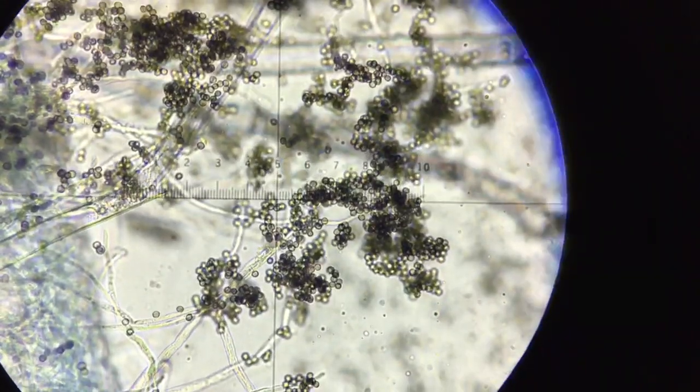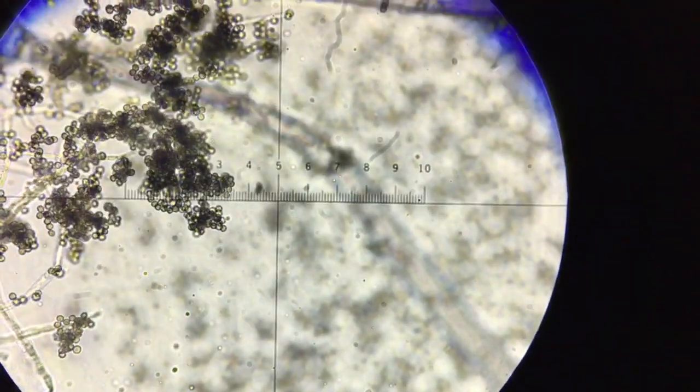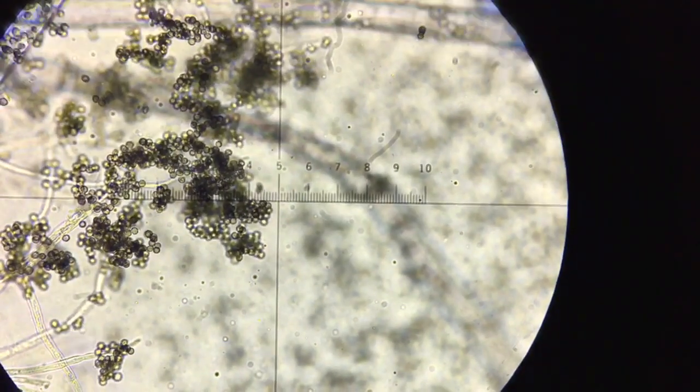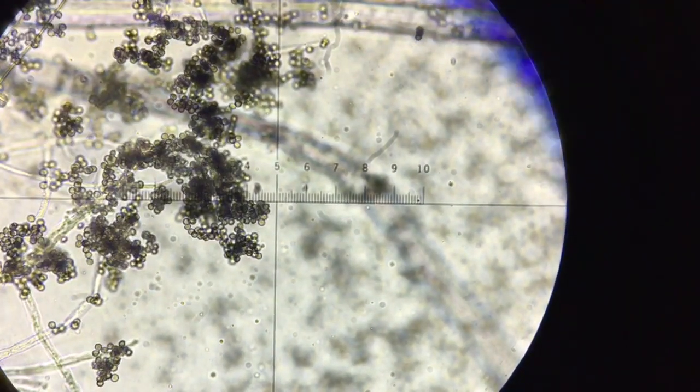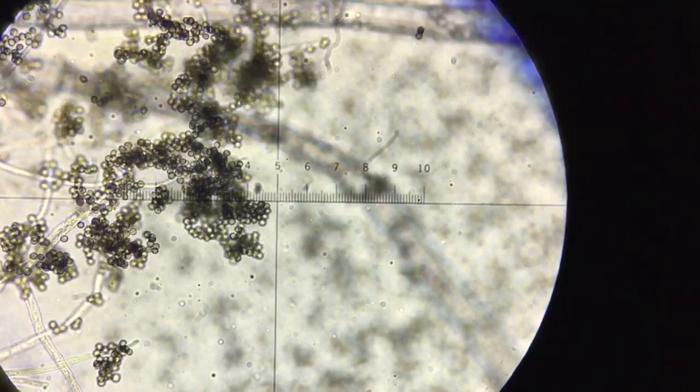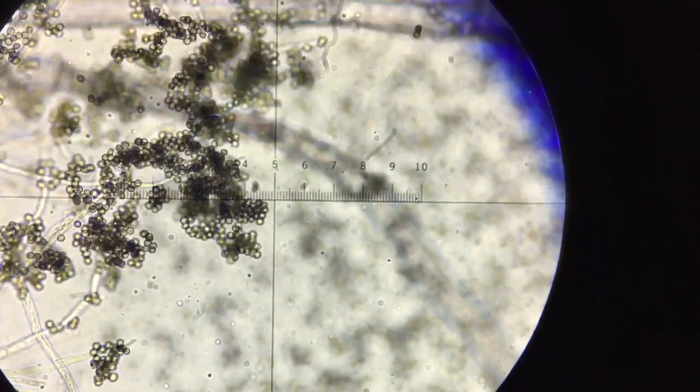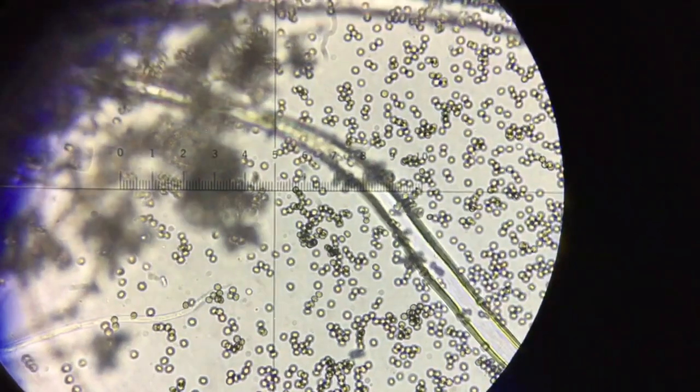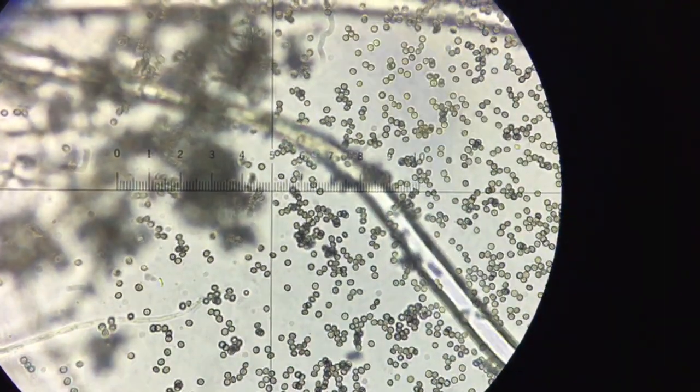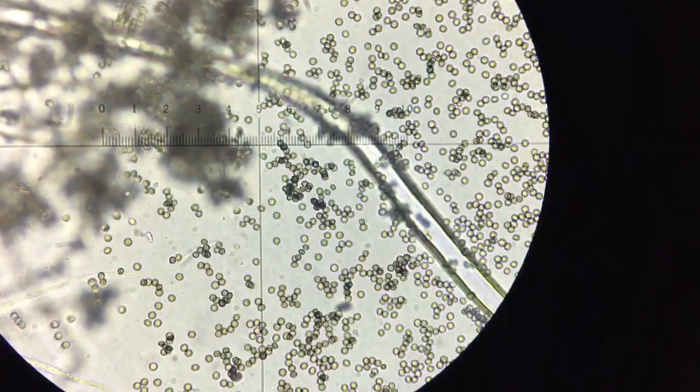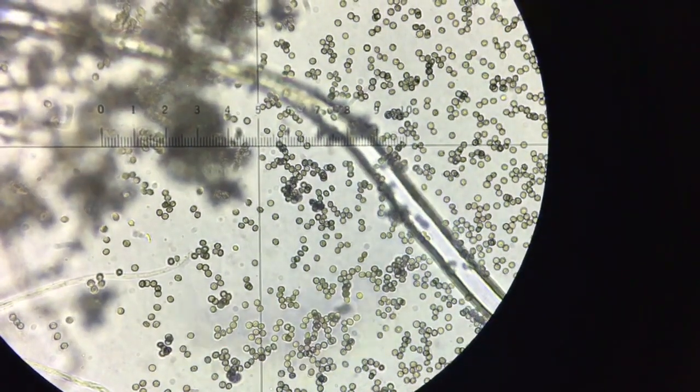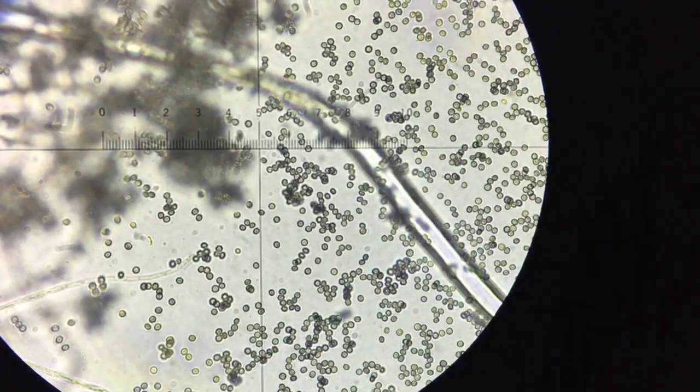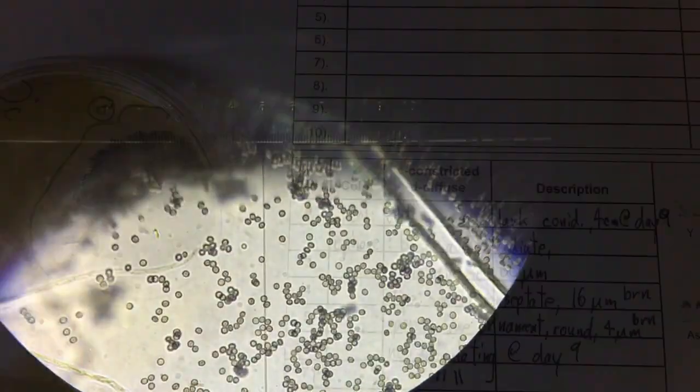The other important thing for Aspergillus Niger are its spores. The spores have a black, rough margin. They will look clear inside, but you stack enough of them together and you'll form a black mass, which you can see here. They are all regular in shape, where the mucorales tend to have some irregularity in their shape. The mucorales tend to be gray colored throughout, and they tend to be smooth, have a smooth edge.